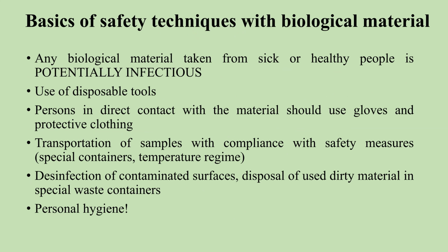Back to technique: all biological material is potentially infectious. We don't know whether a person is healthy or sick, so probably all people should be treated as sick people.